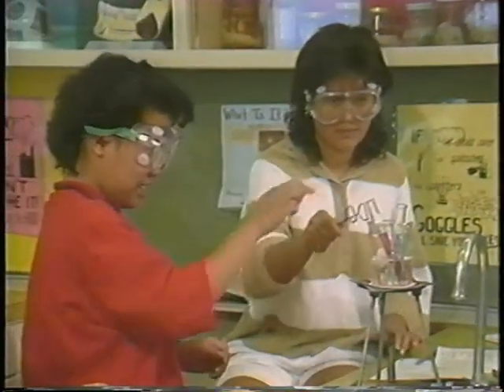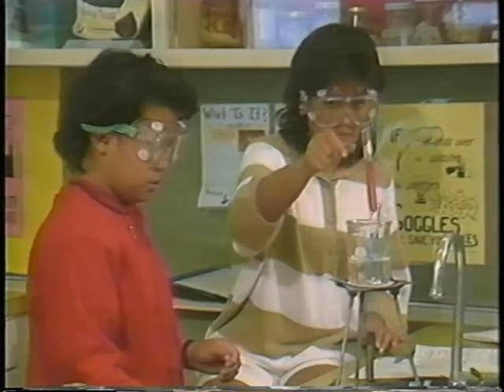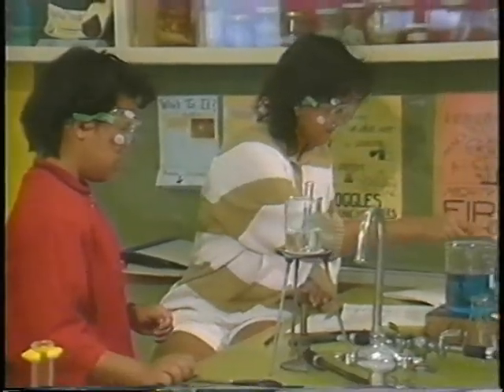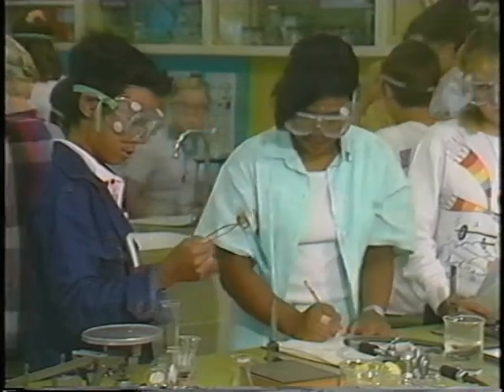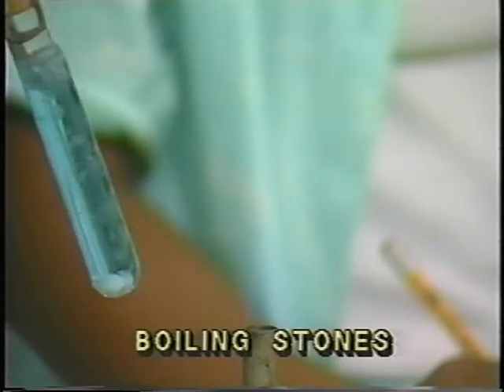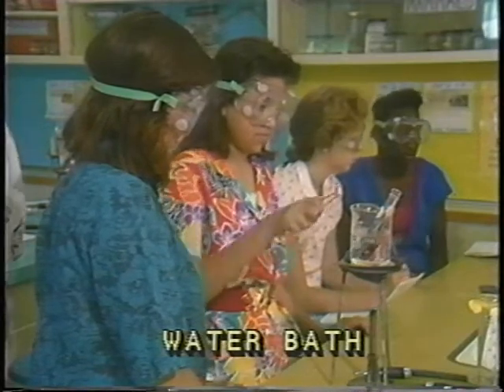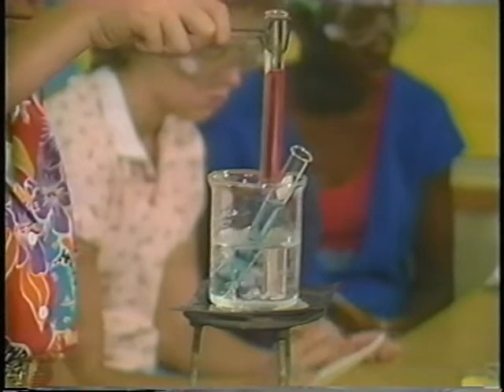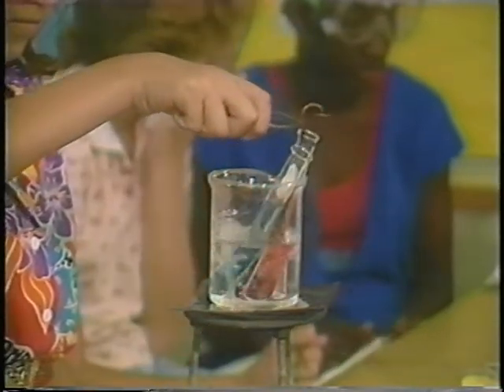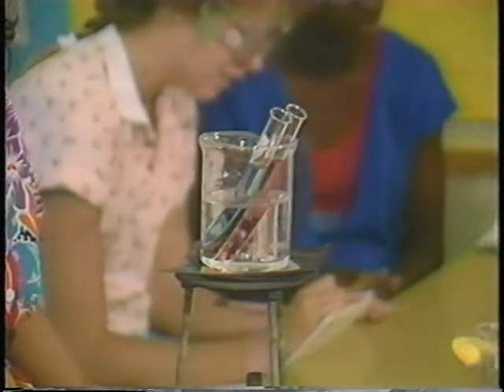Now let's get back to chemistry. Whenever you're boiling a liquid in a test tube, you should use boiling stones or a water bath. Boiling stones are little bits of non-reacting rock or glass that are placed in with the liquid. When the liquid boils, we get tiny bubbles from the stones rather than the big ones we would get without them. A water bath is a beaker of water with our test tube inside. As the water heats up, our test tube will also heat up, but slowly, and only to 100 degrees C, the boiling point of water.